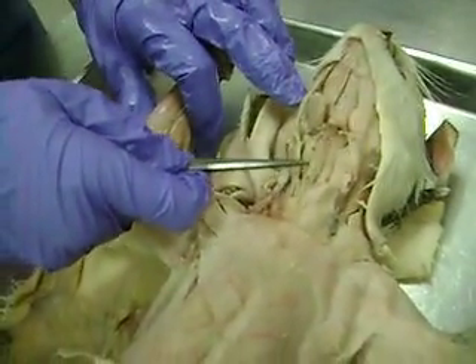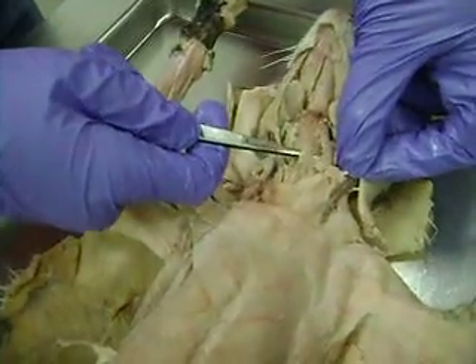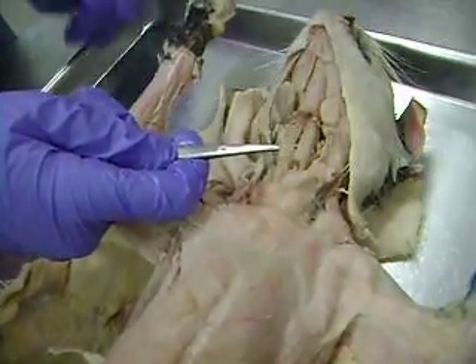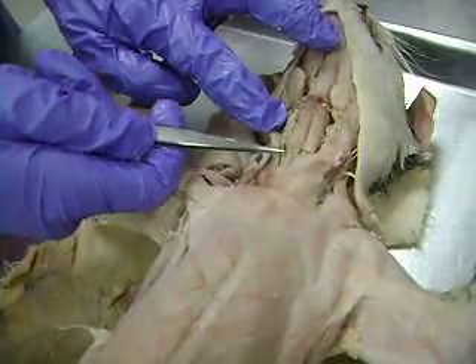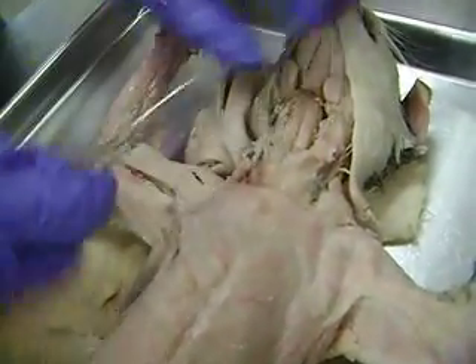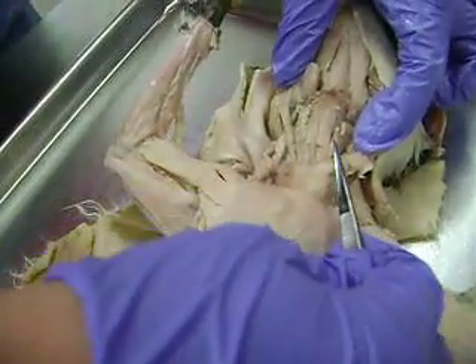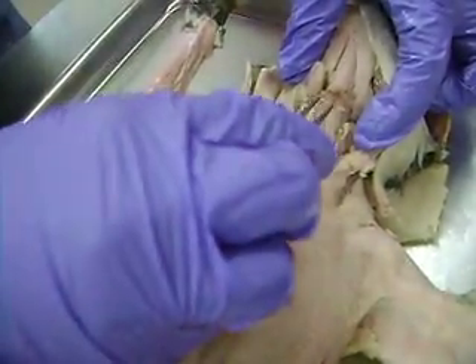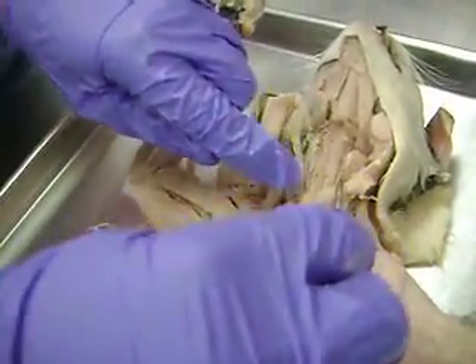And then as we go down lower in the neck, right here lying on top of the trachea — these two muscles here are sternohyoids. And then off to the side of each sternohyoid, this little muscle here as well as this little muscle here are the sternothyroids. So two sternohyoids down the middle and then a sternothyroid off to the side of each.